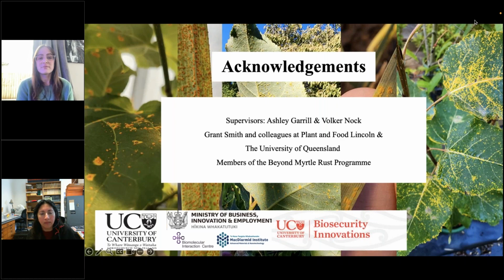There's some research that looks into cellophane, which is a relatively flexible material, and if we had a cover of that and then tried to get them to go through it into a media that has the nutrients that they then need for that part of their growth, looking at that sort of thing. So kind of trying to mimic more of the plant structure, and then the nutrients associated with those different levels.